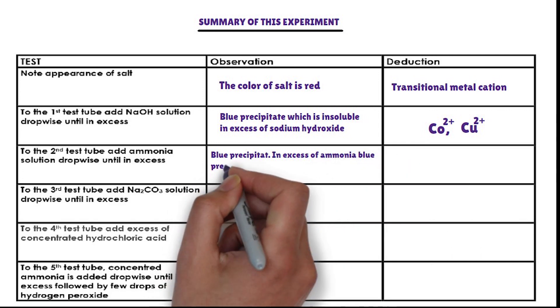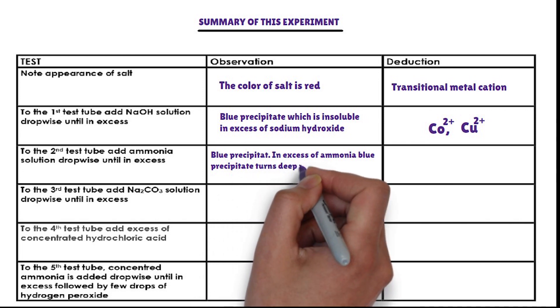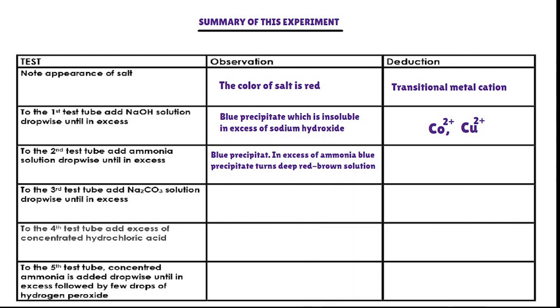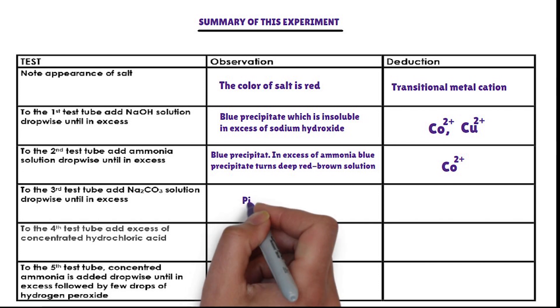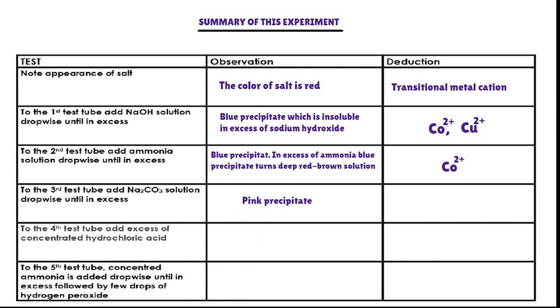The cation that forms a blue precipitate with ammonia solution and the precipitate turns to a deep red-brown solution in excess of ammonia is cobalt-2 ion. To the third test tube, sodium carbonate solution is added dropwise. The cation that forms a pink precipitate with sodium carbonate solution, insoluble in excess of sodium carbonate, is cobalt-2 ion.